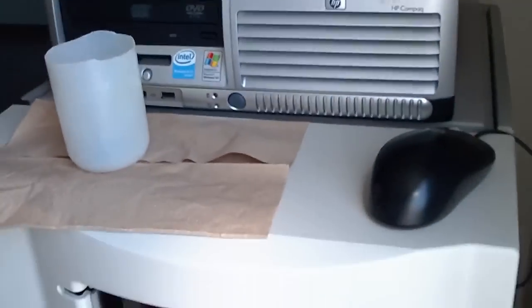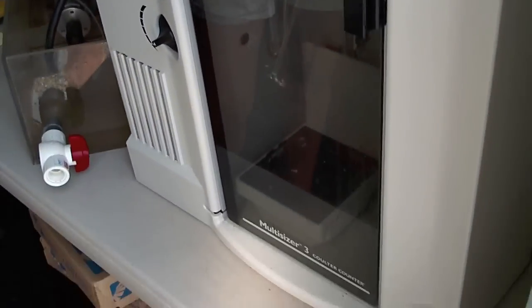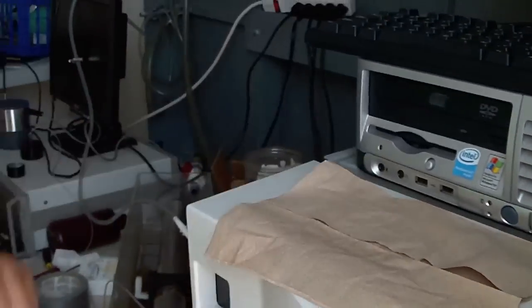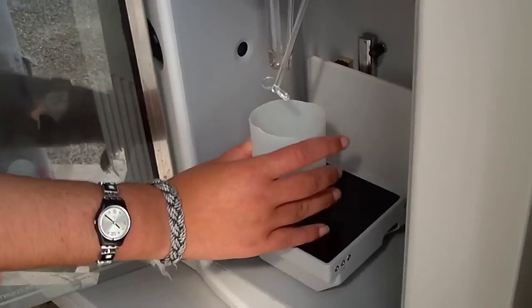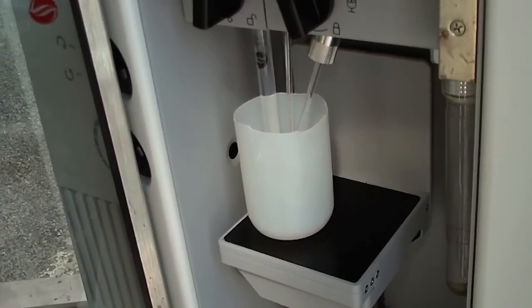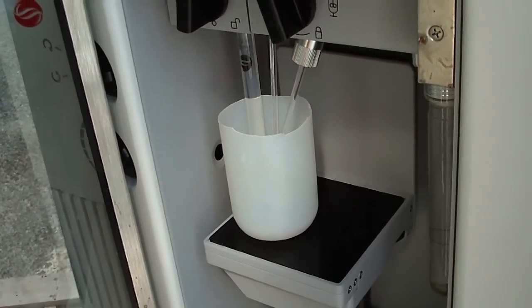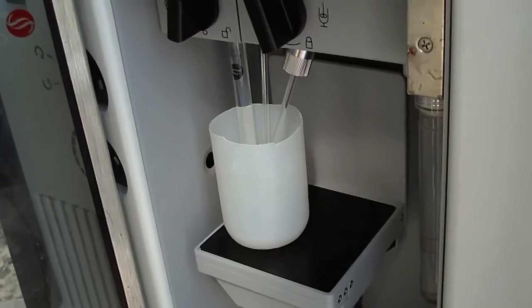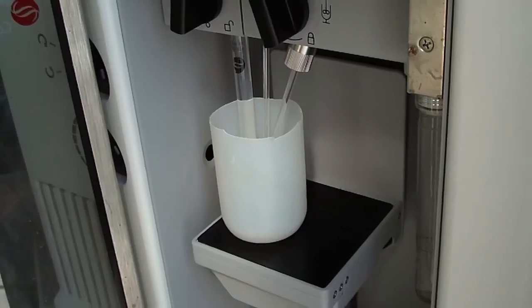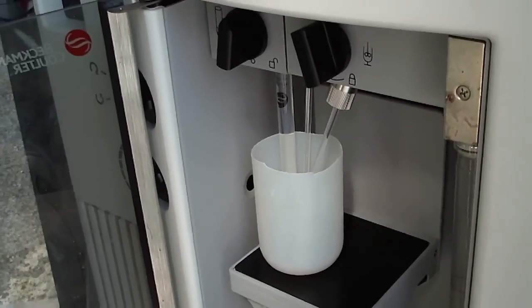So I see another piece of equipment here. What's this do? So this is the Coulter Counter. The Coulter Counter. Yes. With this we measure the particle concentration in the water. You put a little bit of water in here and put it up like this, and this tube sucks water up and measures how many particles come up and their size. Okay. And so that's helpful for knowing how many cells there are, and also what the particle content of the water is.